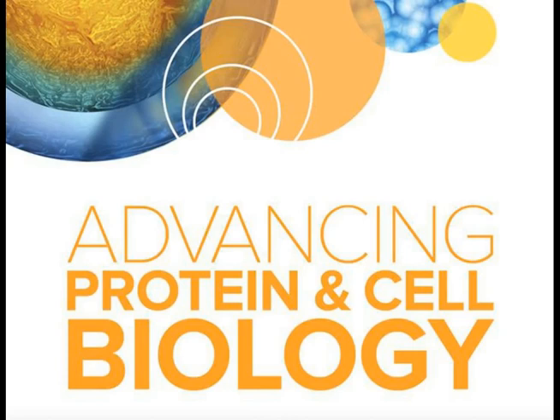There was one question about whatever plate is used, and how the cells are centered in the plate. Can you image in a 96-well plate in an automated fashion? On a low binding plate, the spheroid may not be at the same XY position. How can you get the spheroid centered? Why don't you answer those while I look for the other questions that were similar?